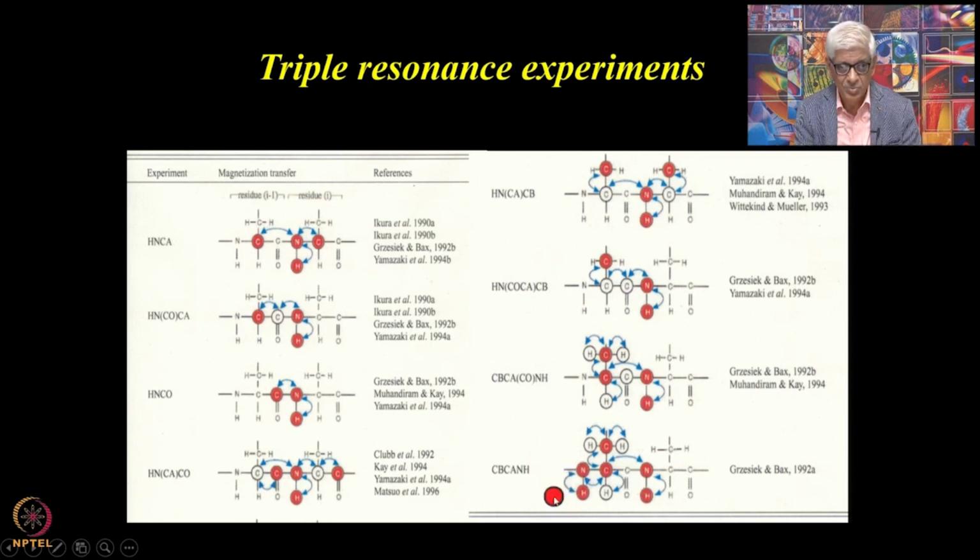So you have this NH proton as well as this NH proton. Once again it goes through the same pathway, from here to here, and you also can go from C beta to this, then from here you can go here. These are all out and back pathways, and from here you start from the C alpha and go to this nitrogen as well.